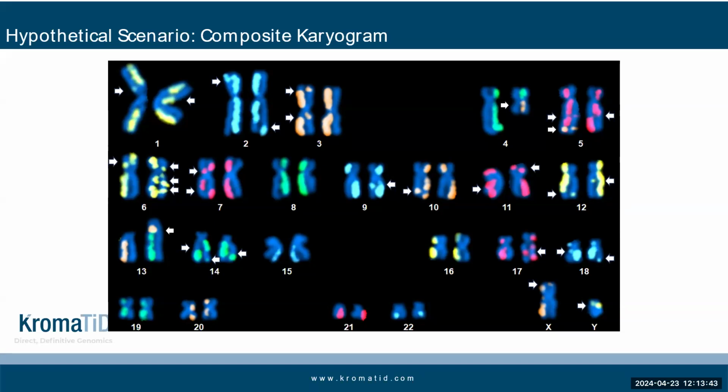Sequencing could be used to detect very small variants. However, data quality depends on the specific sequencing platform, read depth, and alignment algorithm, especially in highly repetitive regions. Without any bioinformatic intermediate step like sequence alignment, DGH enables direct visual confirmation of data.